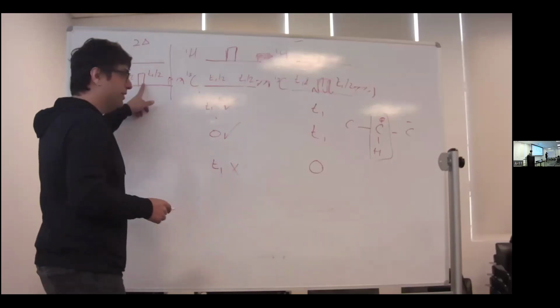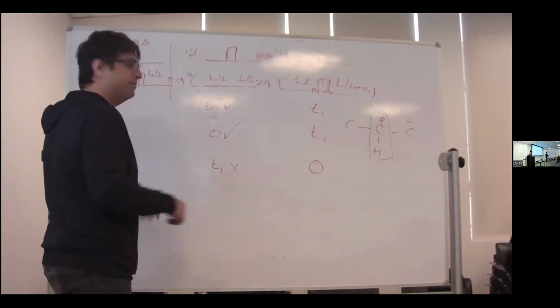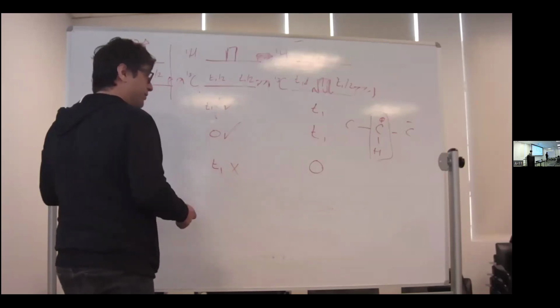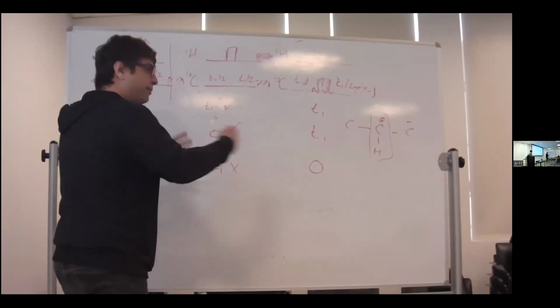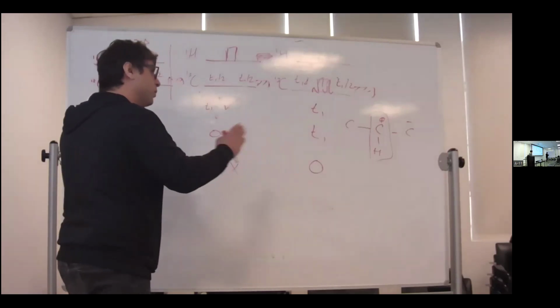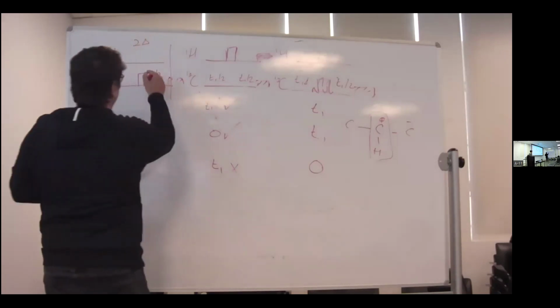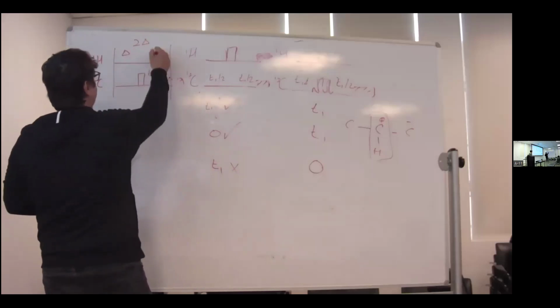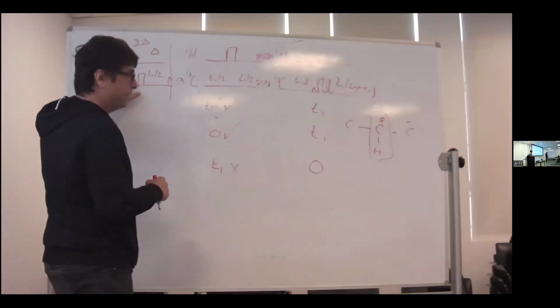So take this 180 and shift it to the left or to the right. Either way. Let's go left. Okay, so let's start shifting it to the left. Shifting it to the left means that as I increment, it's moving more and more to the left. So what's the mathematical term I should write? So let's say this is 2 delta. Let's put it in the middle. Then the 2 half periods are each delta. So in your perspective of moving it to the left, what would I mathematically call this?